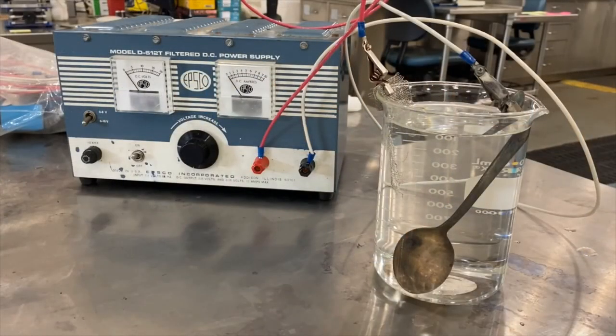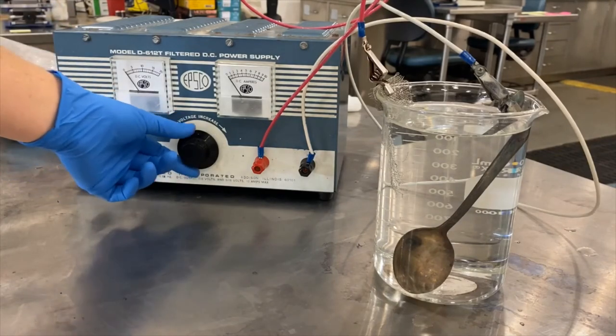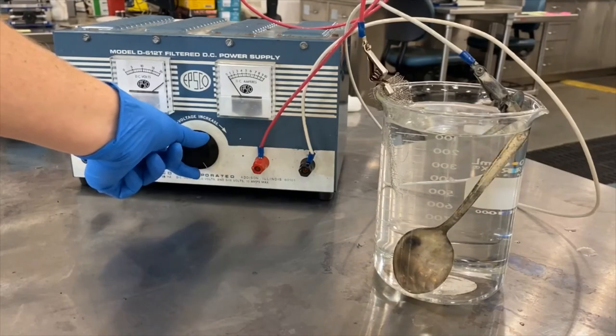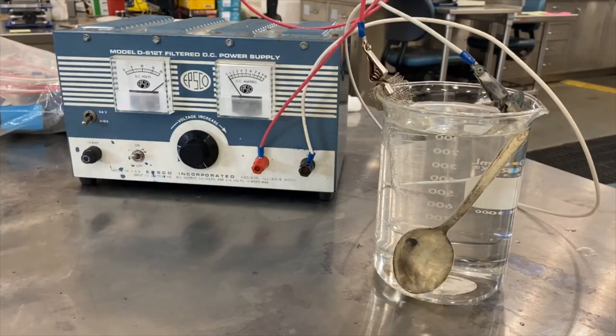If you can please direct your attention to the surface of the spoon, we're actually going to be using a much higher voltage and amperage than we would tend to employ on an archaeological artifact. But we're trying to speed up the reaction so that you can see the process very quickly. There you go. You can see how very fast that reaction can take place.